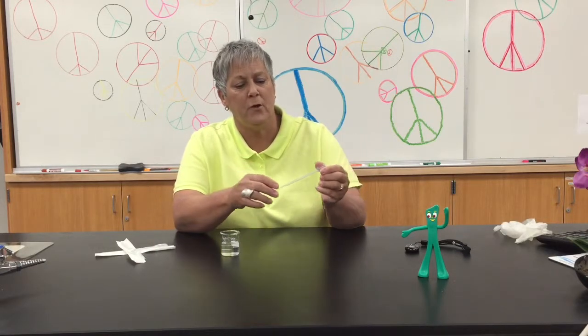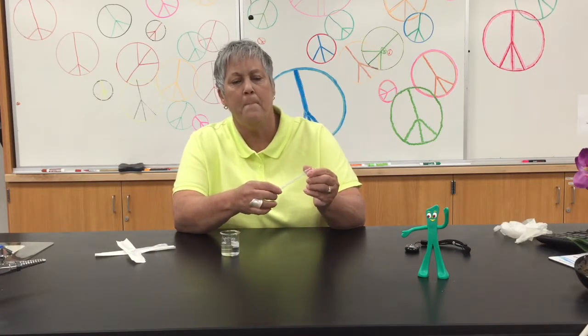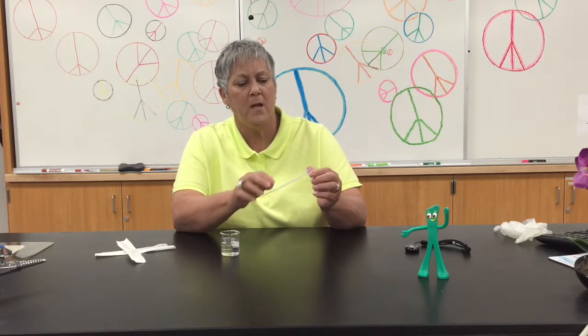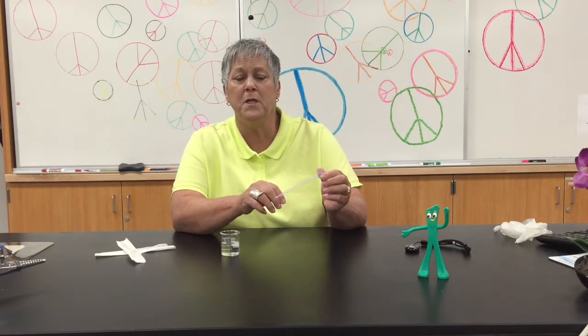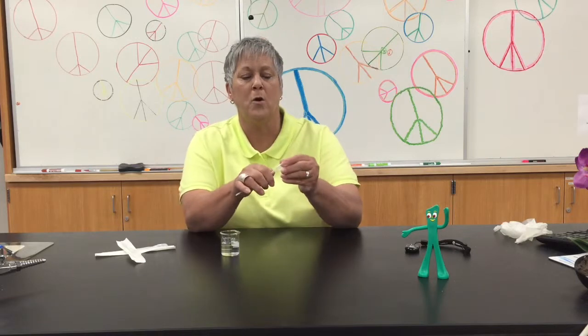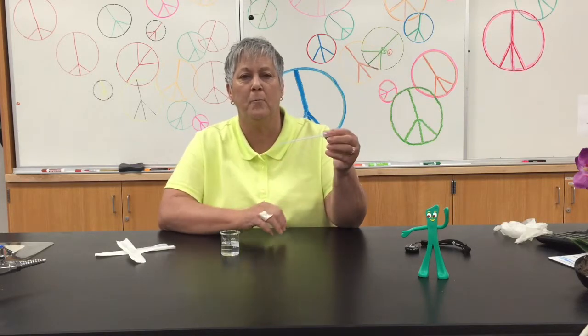When you work with one of these pipettes you're going to see some little marks along the length of the pipette, and typically when we use these we are wanting to pipette one mil of fluid. The one mil mark is all the way up at the top just below the bulb.